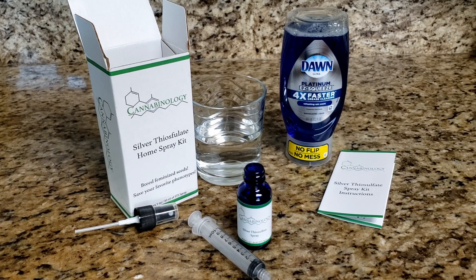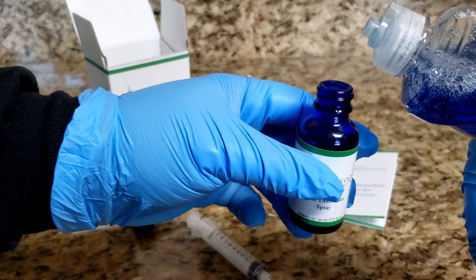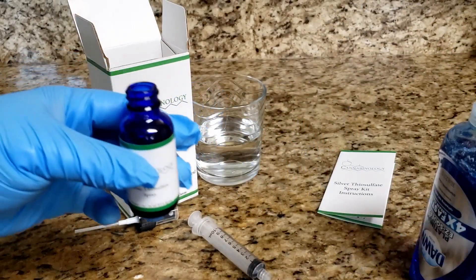The final step of the dilution process is to add just a tiny bit of soap. The soap that we recommend is Dawn dish soap because it's environmentally friendly, but it really doesn't matter — any kind of soap will work. The reason we use soap is as a surfactant. Basically what it does is it helps the STS solution spread more evenly across the nodes, the stems, and the leaves of the plant, creating more surface area for the STS compound to be absorbed. So we're going to go ahead and add our dish soap — just a very, very small amount, literally just a tiny drop. You can put an extra one if you'd like; that won't mess it up too much.